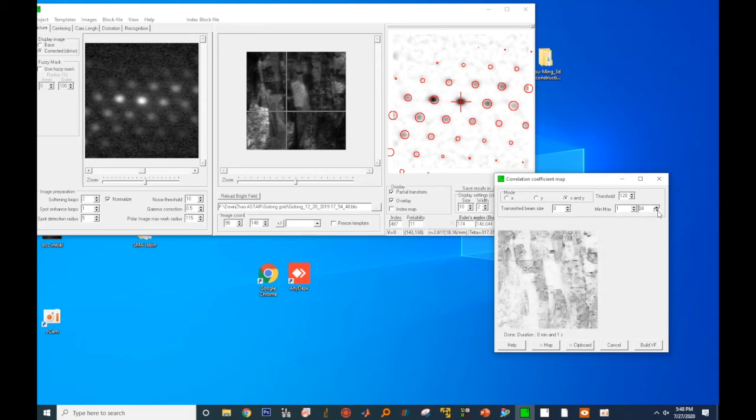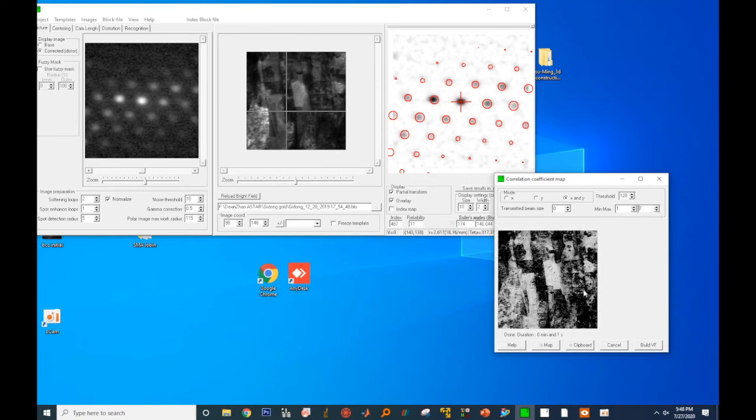We selected X and Y. So the pixel will compare to its left and right, top and bottom to generate the map. If you select X, then the pixel will only compare to the pixels left and right to itself. You can extend the idea to Y mode.